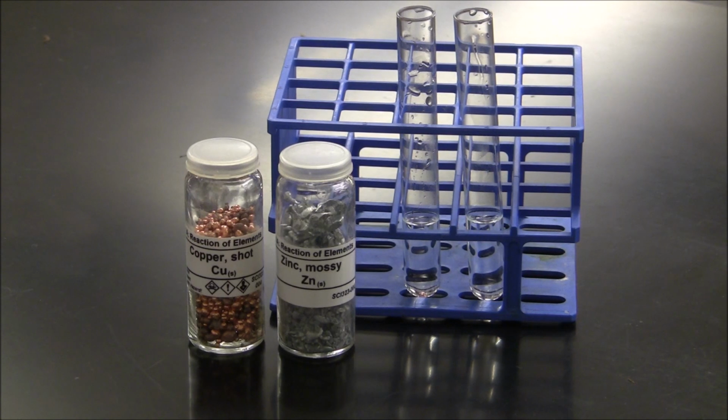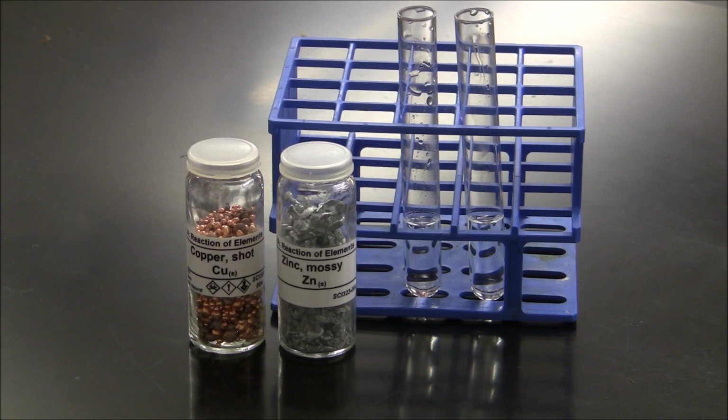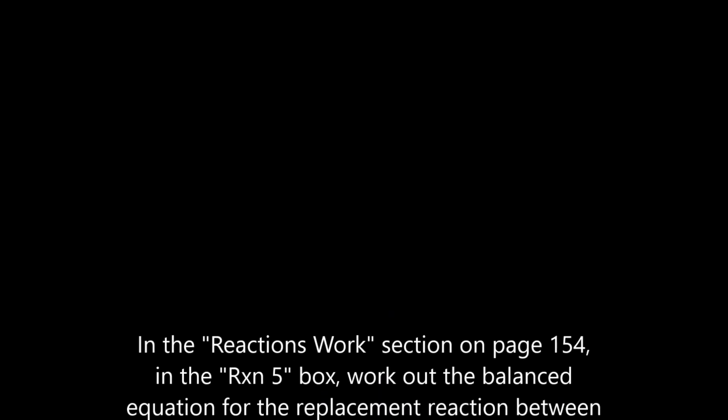In your data table, write down your observations for the reactions between copper and hydrochloric acid, zinc and hydrochloric acid, the observation of what the gaseous product did when it came in contact with the burning splint, and then give the identity of the gaseous product itself.